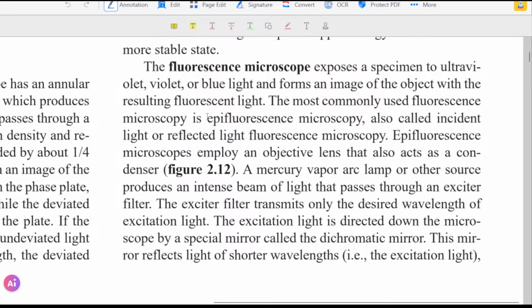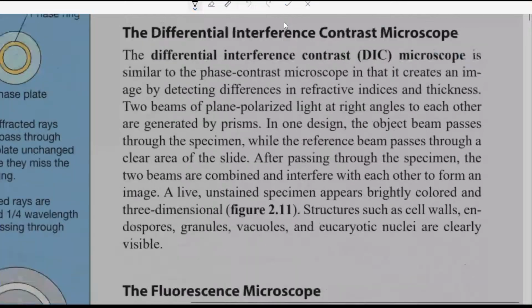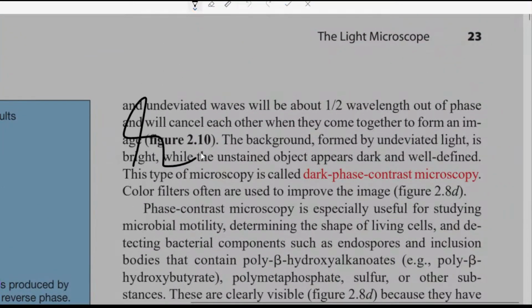In all this, you put the light that you wanted, of your wavelength of the higher energy, and they release it back. This is the basic principle. In this case, we don't study the light passing through, like we don't study refraction. We study reflection. Till now we were studying refraction, right? But now we are studying reflection.